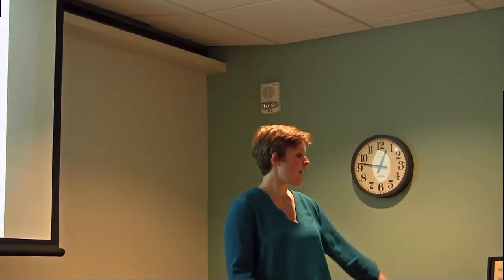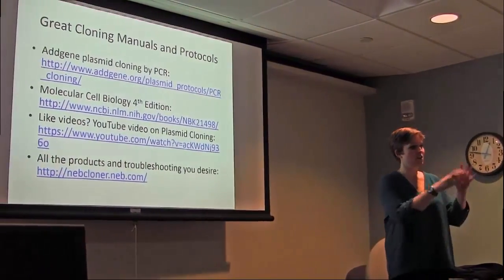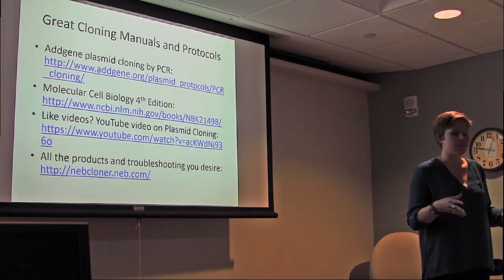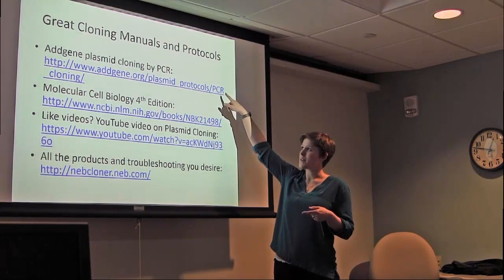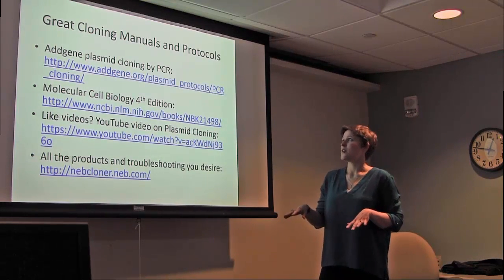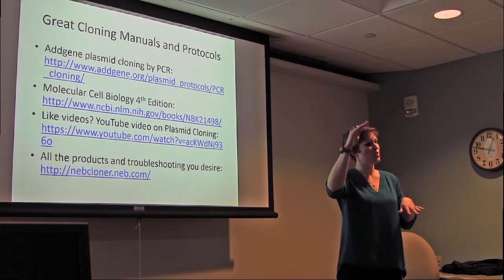Okay, so I have great cloning manuals and protocols here. Ultimately, you saw an example, but when it gets to the nitty-gritty and you have a question, you want an answer at hand. So you can go to the Addgene plasmid cloning by PCR handbook, a really nice little system that goes through it step by step.